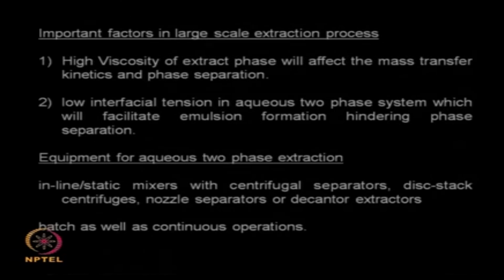We need to think about large scale operations, because whatever is done in the lab needs to be scaled up to kilograms, kiloliters, cubic meters and so on. So, very large scale operations. When we talk about very large scale operations, there are a couple of very important parameters we need to consider. One is the viscosity, the other is the interfacial tension.